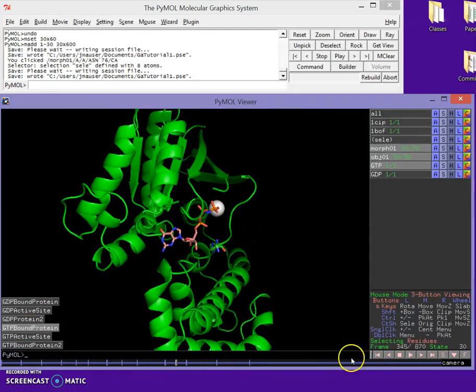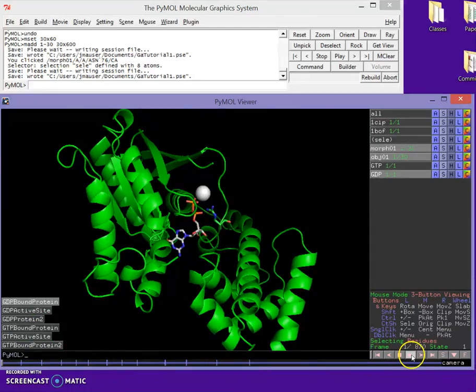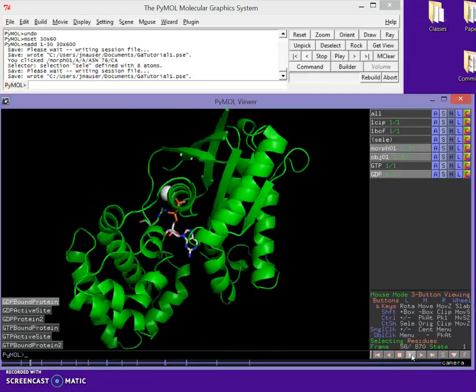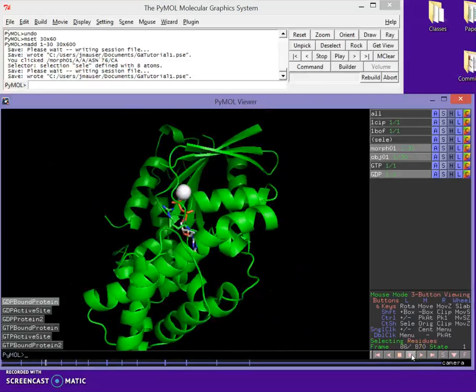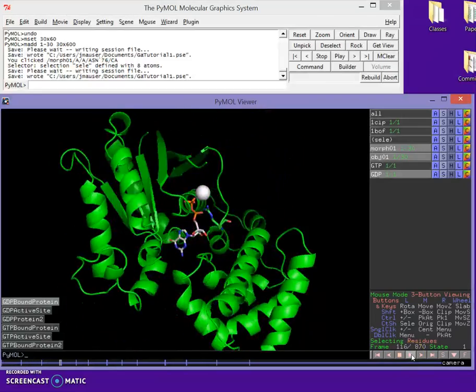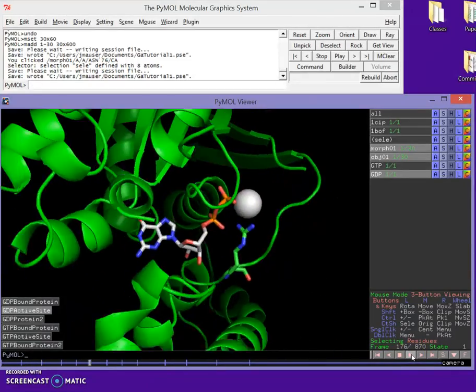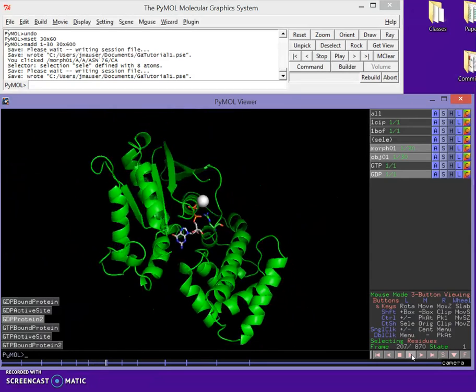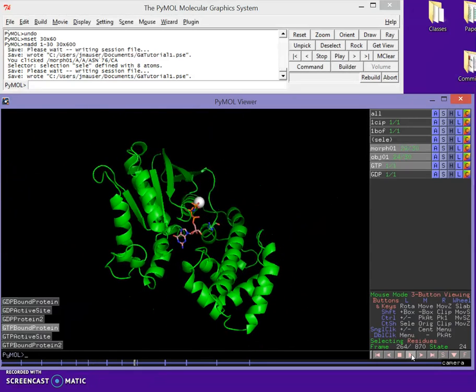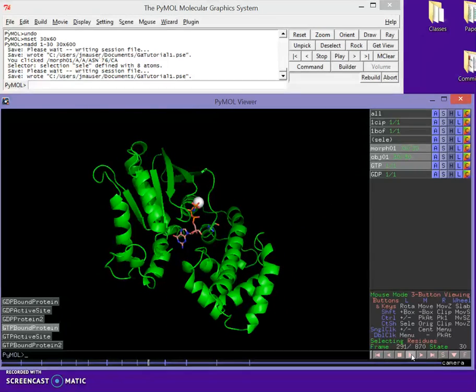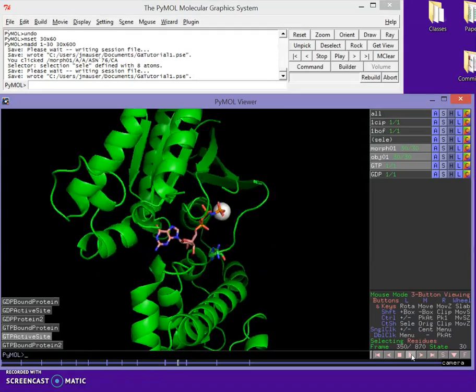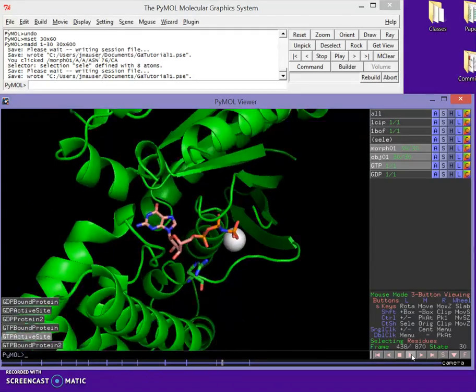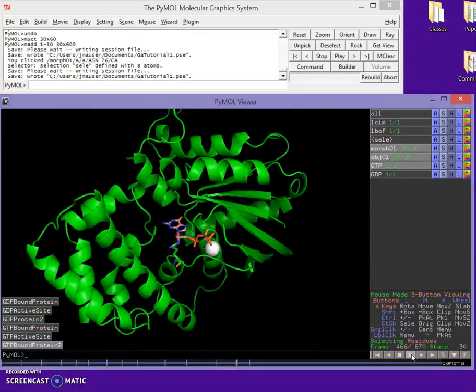So let's watch our whole movie here. Spin. I'm going to zoom into the active site. Watch. Then it's going to start to do its morph. Then it's going to zoom back into our GTP in the active site. Then it's going to zoom back out.